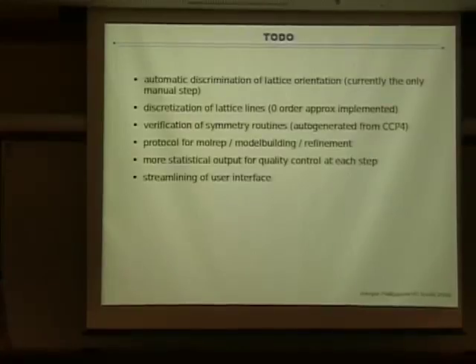But the tools we have, I mean, we have this, where is it? This plot here. I guess this should be highlighted in black also. You can plot your lattice lines in this plot viewer, and there's metadata associated with each plot. So you move with the mouse over the plot view and see exactly which image it comes from. So you have the lattice line, you have the outlier, you go there and say, oh, this is image 225, and you go and analyze image 225, what went wrong. That's possible, but that's manual. I wouldn't know how to do that straightforwardly in an automated way. There's a lot of things to do, obviously.